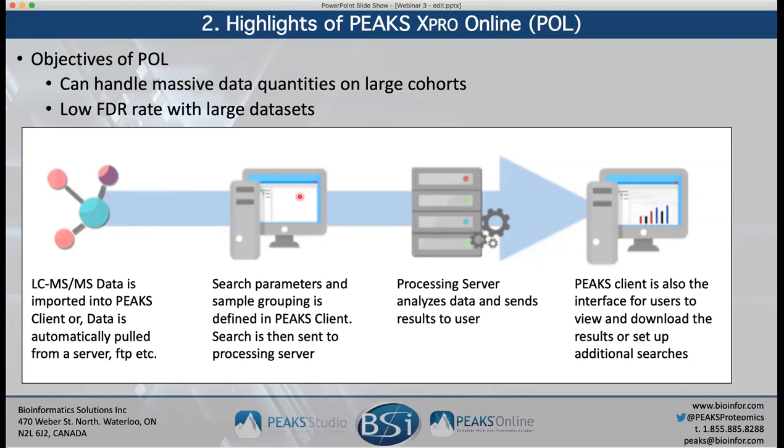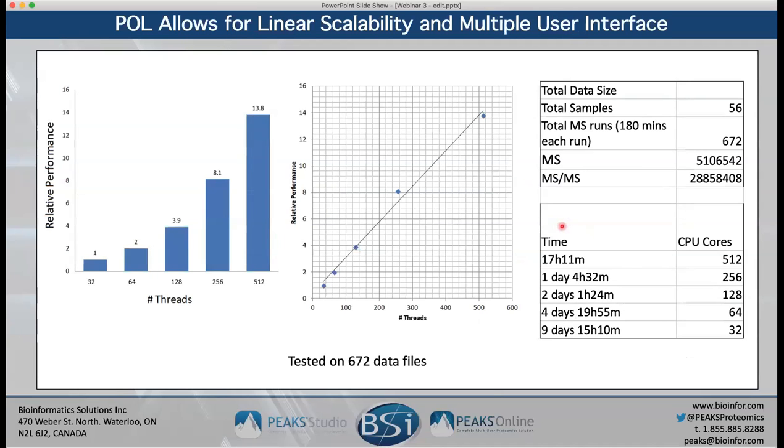We suggest Chrome. And basically what happens is your LC-MS/MS data is ported into that client, or a repository is set within the client. You go into the client, you set up all your search parameters. The work happens in the background on the processing server, and then the data comes back to you via the client. And that's where the interactive results will be set up, and that's what I will hopefully show you in the demonstration.